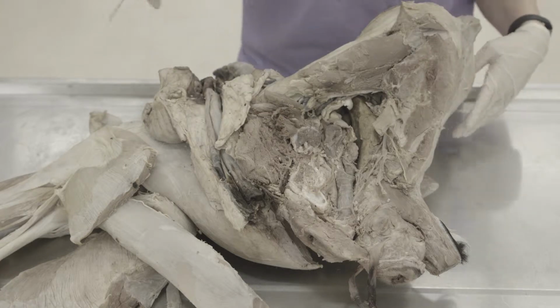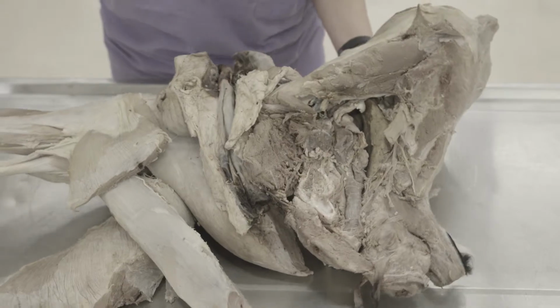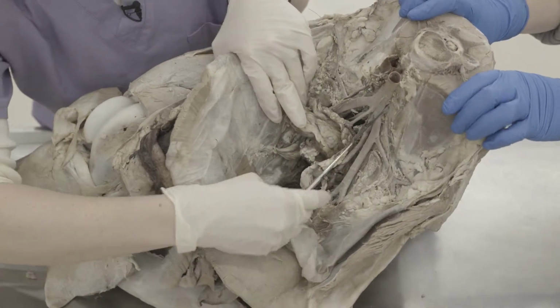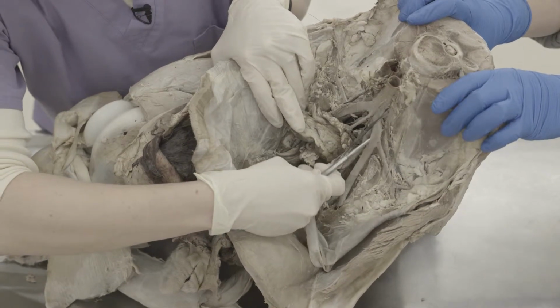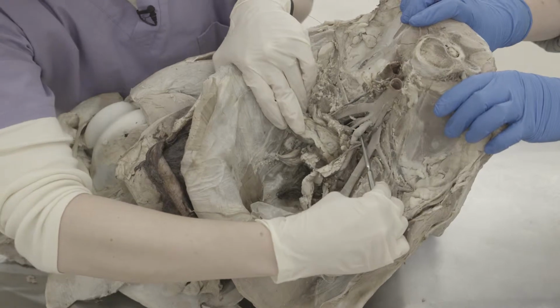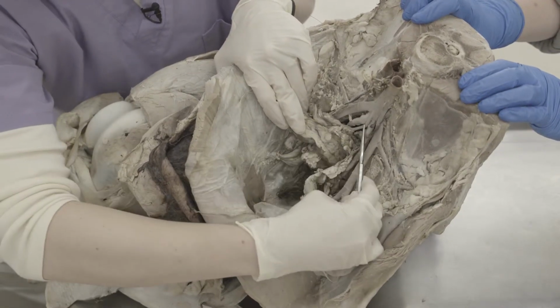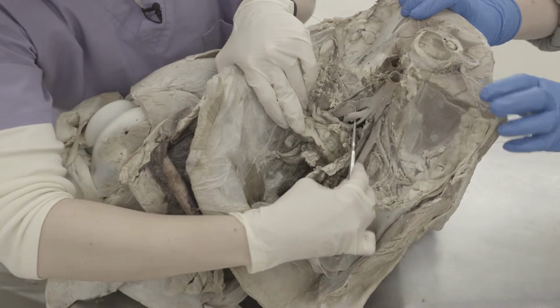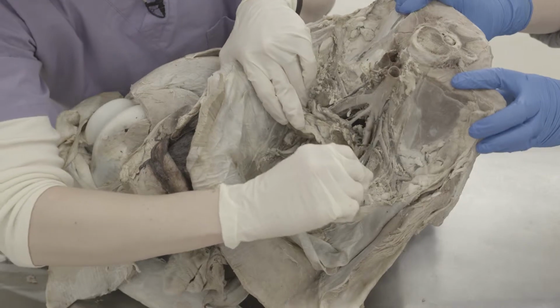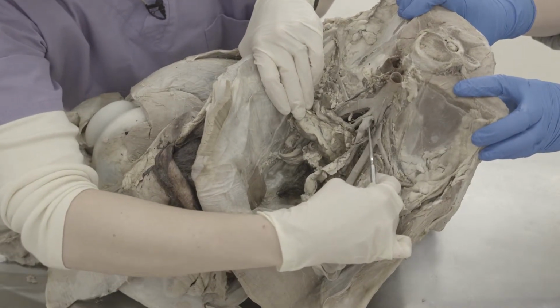All right, so we're going to start within the pelvis, so I'm going to flip this over so that you can see the inside. So here we're going to just quickly review. We did the external iliac arteries previously, and now we're going to work on the internal iliac arteries. So here's an internal iliac artery on the left side. Here would be our internal iliac artery on the right side, and then here in the bovine you have that median sacral artery.